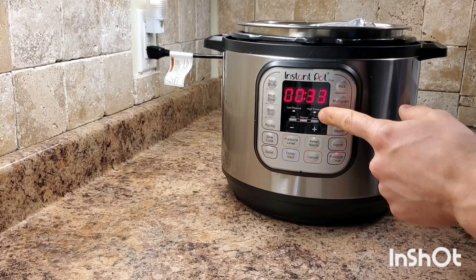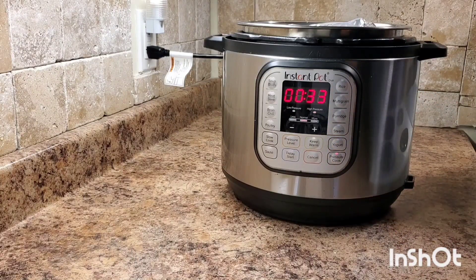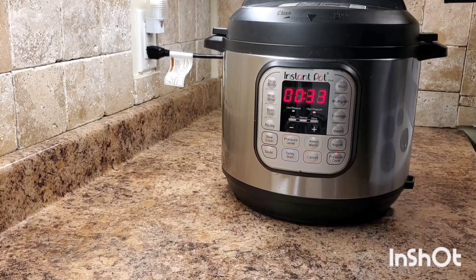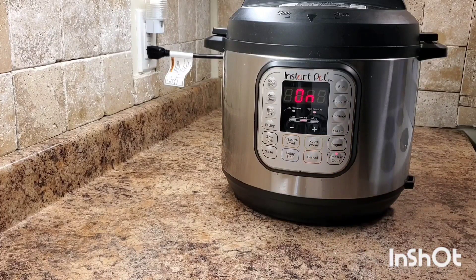We're going to pressure cook on high pressure for 33 minutes, which seems to be plenty of time to completely sterilize the liquids inside. We're going to put the lid on top, seal it, take off the keep warm setting, and let it do its thing.